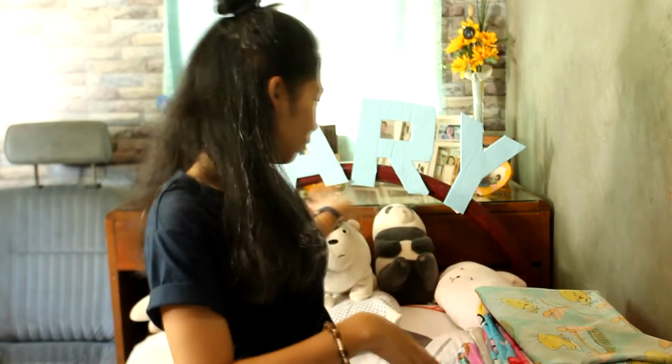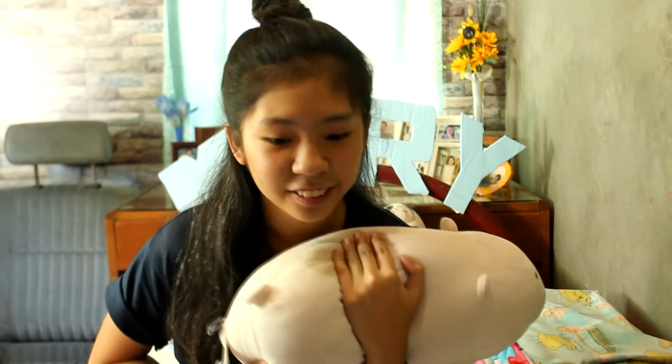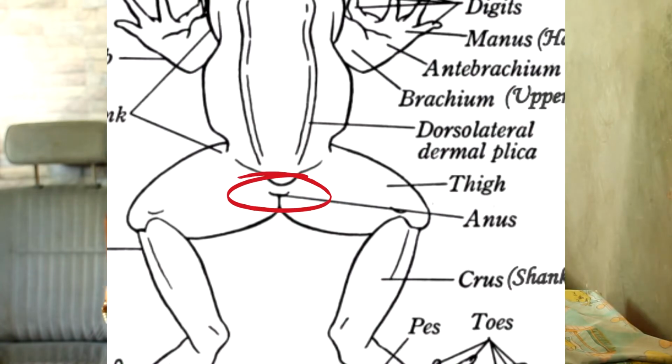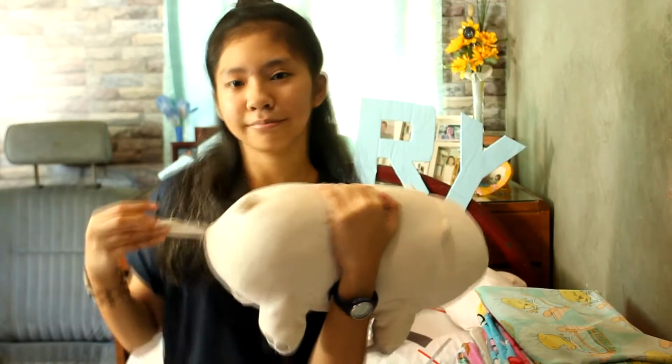The posterior half is divided into two. The abdominal region, which is the ventral portion, here. And then also the lumbar region, which is the dorsal portion, so here. Then we have the anus, the small opening at the end of the trunk where waste comes out.